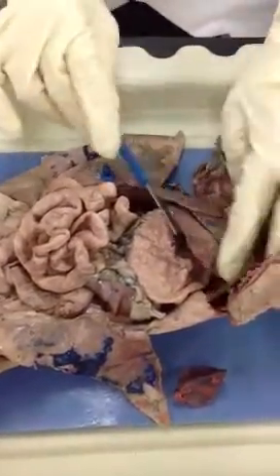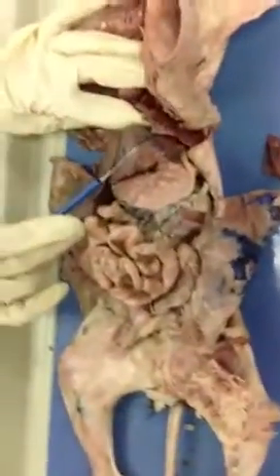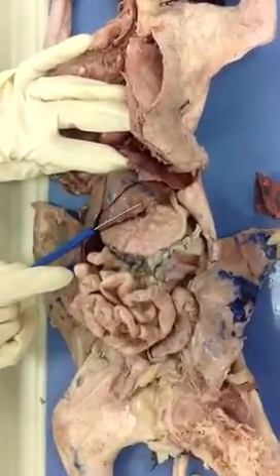Now here we encounter this organ. Which organ is this, please? The liver. Now let's go over the lobes of the liver. Which lobe is this, please? Left lateral lobe. Very good.